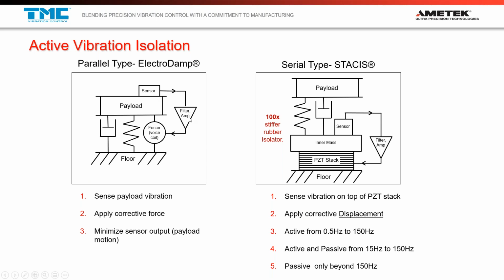It is a feedback system. So what it's going to want to do is try to keep the sensed signal at zero, basically. So it's going to want to send a signal that's equal and out of phase to what's being sensed on the surface. And it's going to go to its voice coil motors, and it's going to say, okay, this is the force that we have to apply to try to make my sensors stay still. And for very, very layman's terms, it's equal and out of phase.